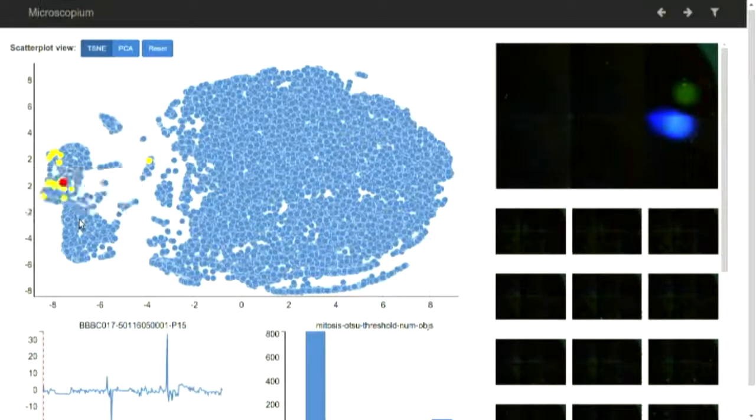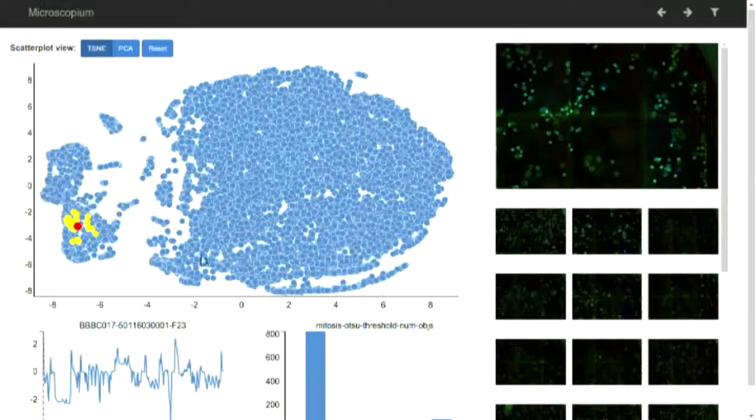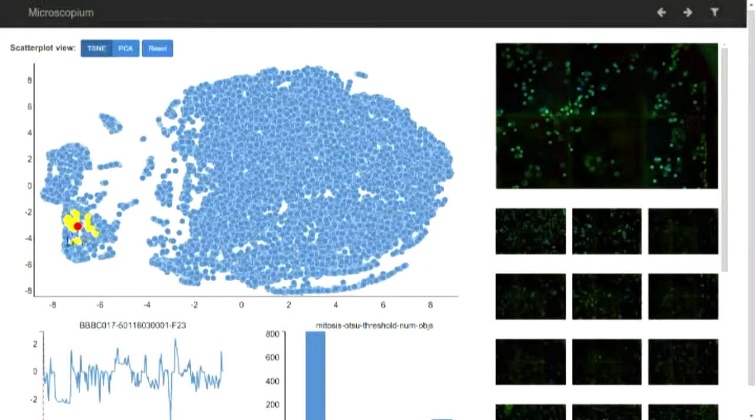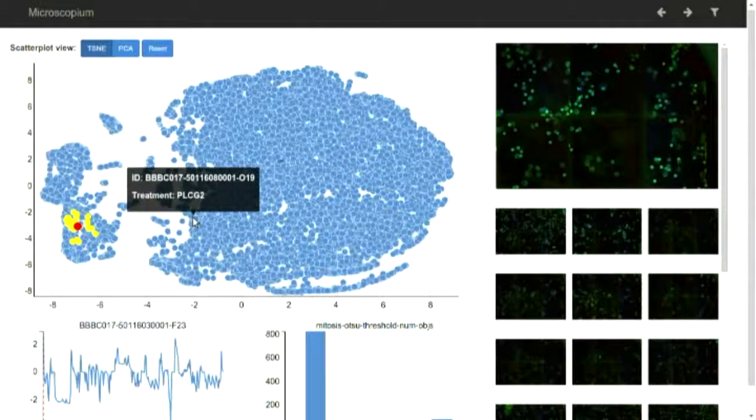Without any prior training or knowledge, it's actually created this grouping of all of the images. In the Microscopium interface, I can click around this scatterplot and each time I click on one of those points, what I'm getting is the image that's represented by that point and its 25 nearest neighbors. This being the images that our features are determined are most similar to the one that I've just clicked on.